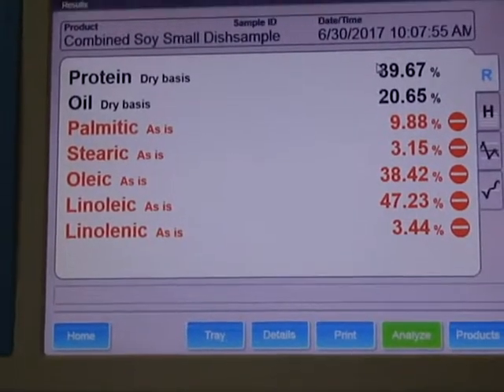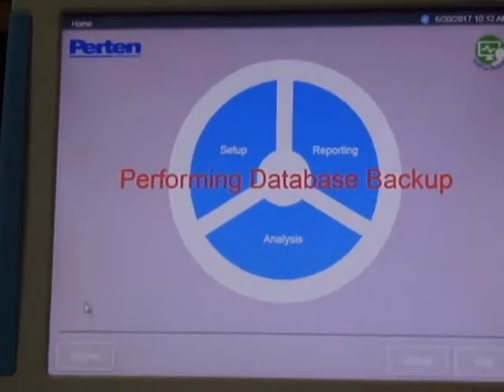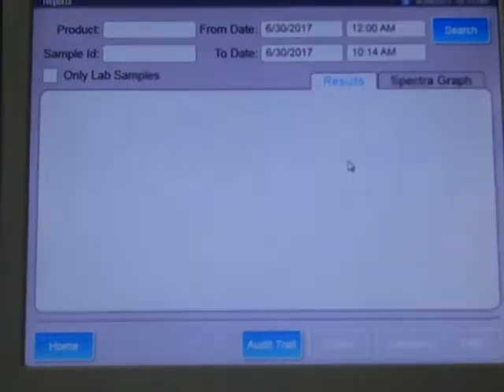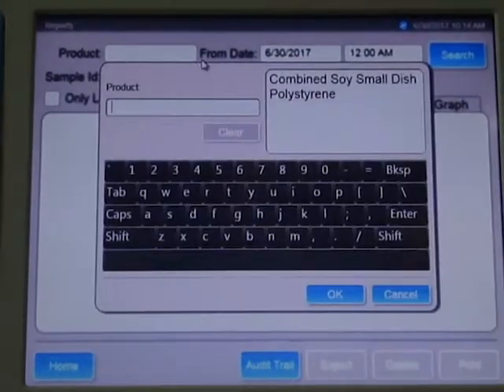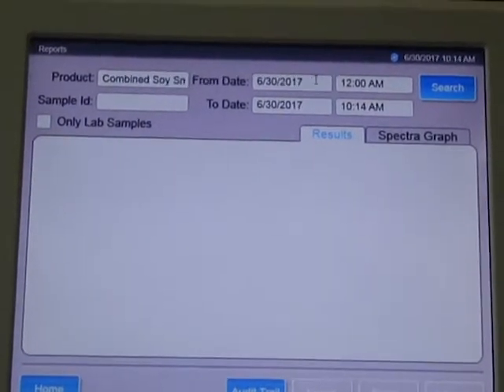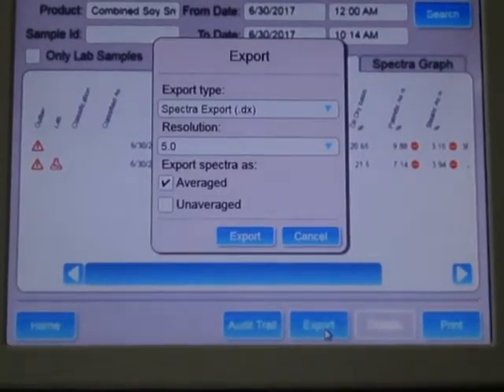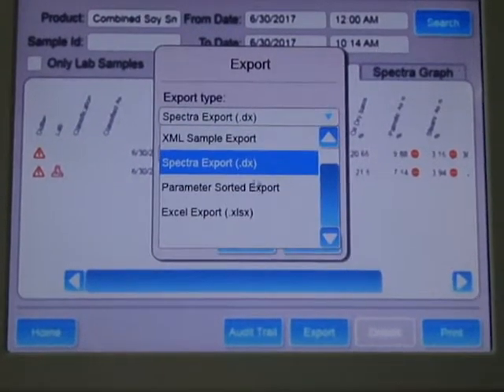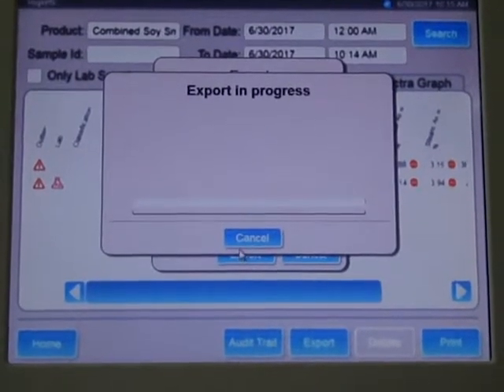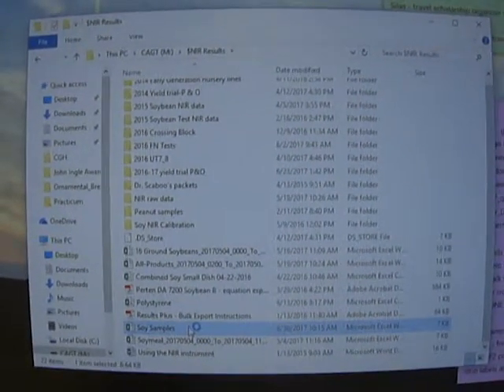When all the samples have been read, click the home button in the lower left corner of the screen. The machine may perform a database backup at this point. To export your results, click the reporting button. Select the product for the results you want to export. Make sure the analysis date and times are correct. Click search. Export the results to an Excel file by choosing Excel export in the export type box. Click export. You can now open the Excel file to view complete results of the analysis.